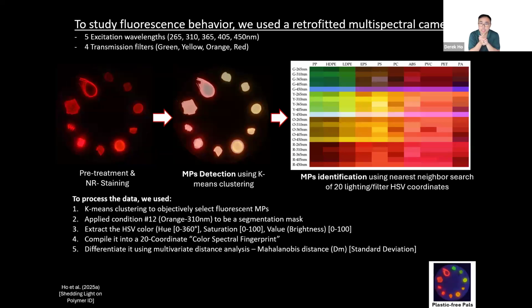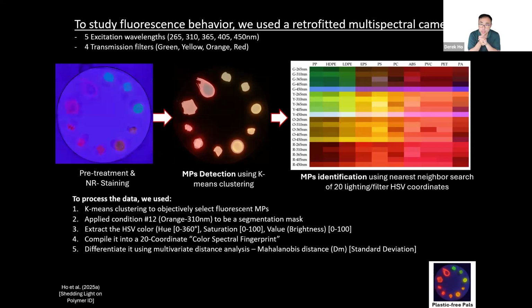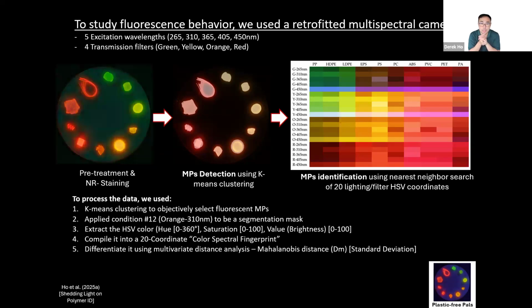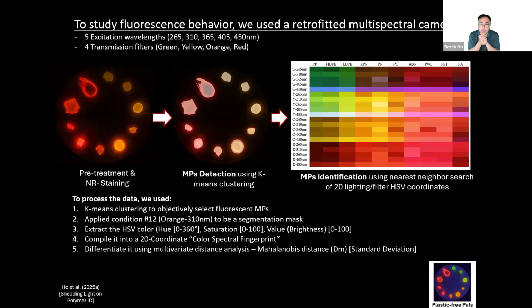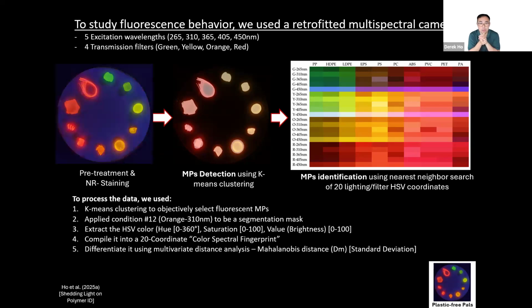By using this coordinate system, we are able to align it more intuitively to human perception, and allow more weight to be applied onto the hue element rather than the other 2 parameters.